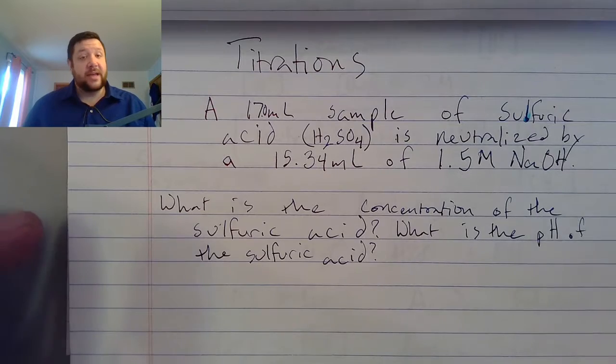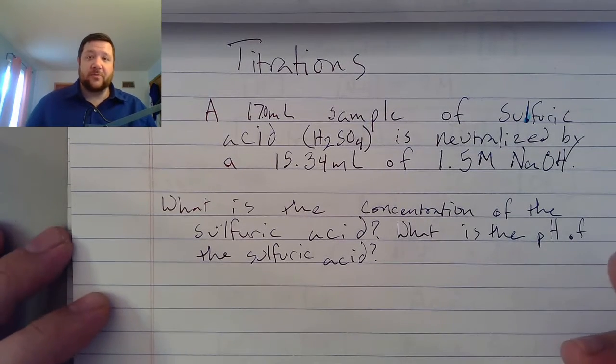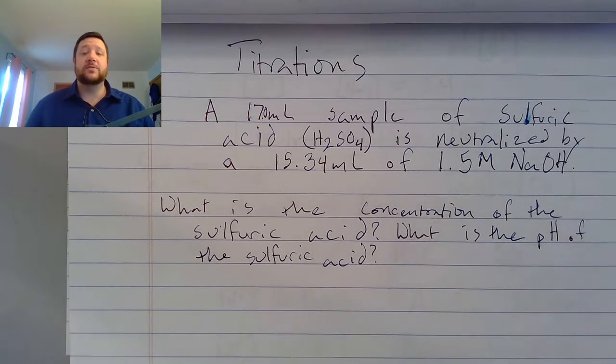Today we're going to talk about titrations. So, a titration is a type of reaction between an acid and a base, and with that acid and base, we are neutralizing an unknown sample.